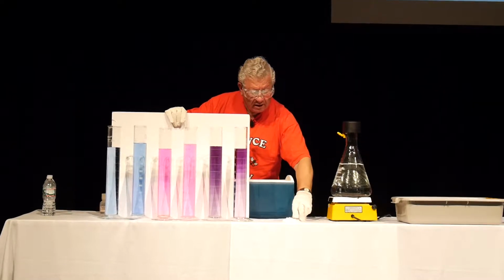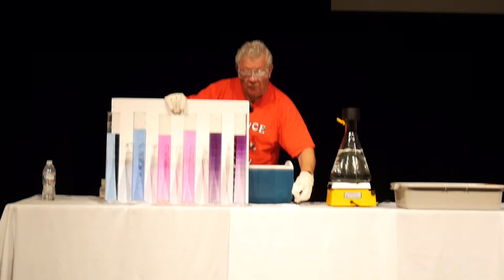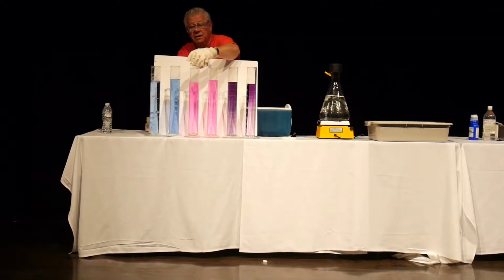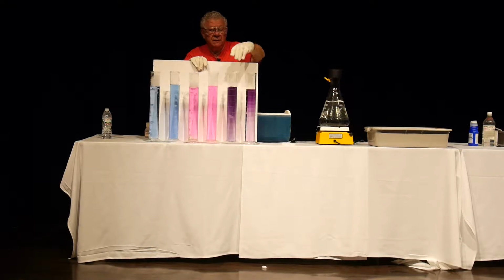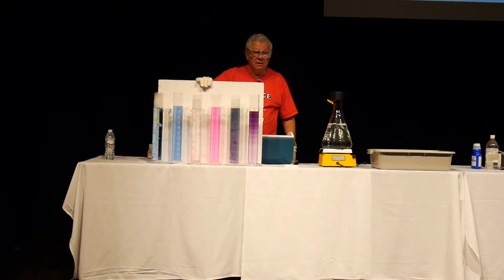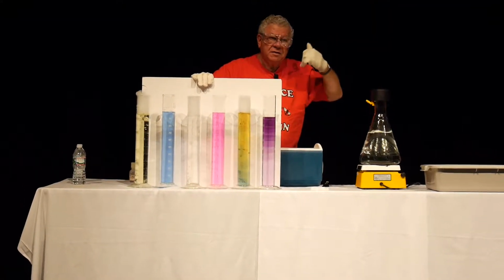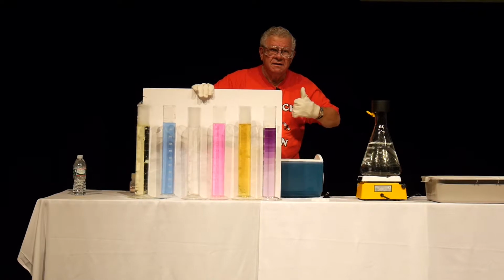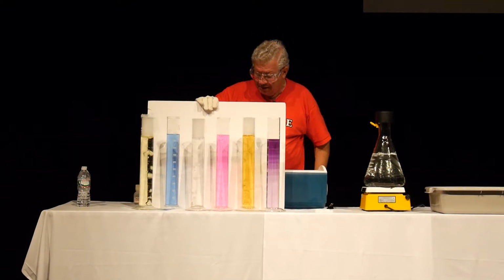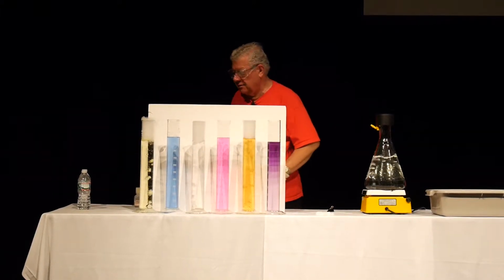But if I take a few chunks of the dry ice, one just dropped on the floor, and I put one here, and one here. Now do you see anything happening? What's happening? Whoa. You're talking on a cell phone to somebody else and telling them what's going on. Don't raise your hand, just say it. The colors are changing because the gases, they have a chemical reaction. You know what?